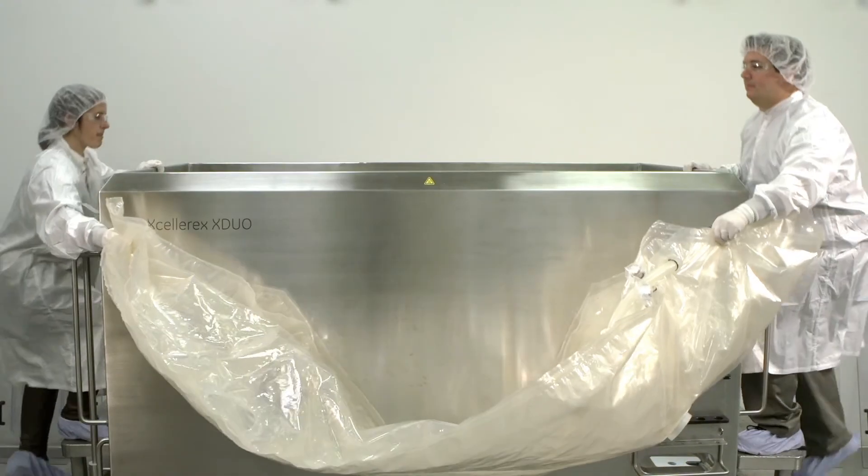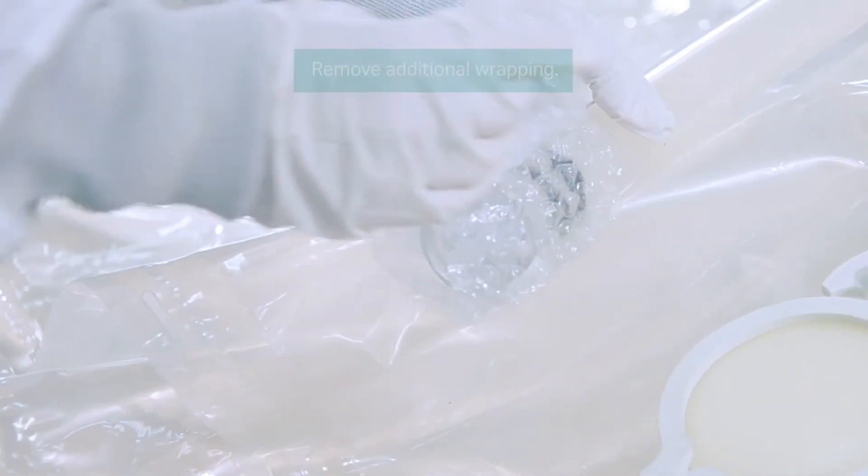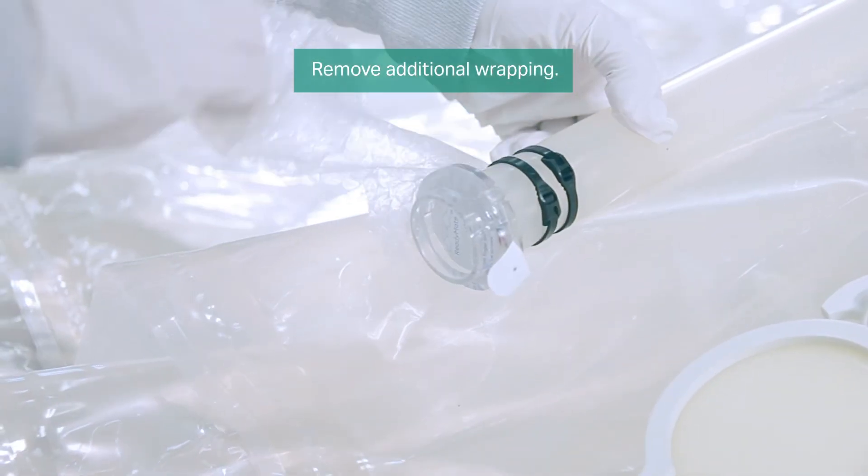The disposable bag assembly is now ready to be installed into the vessel. Once installed, remove any additional wrapping at the top of the bag.